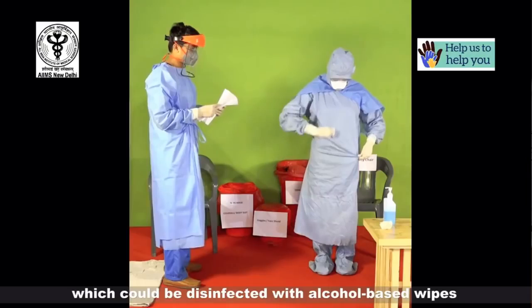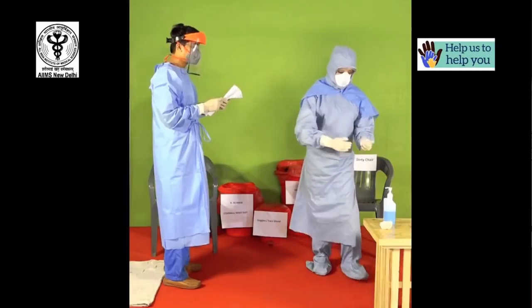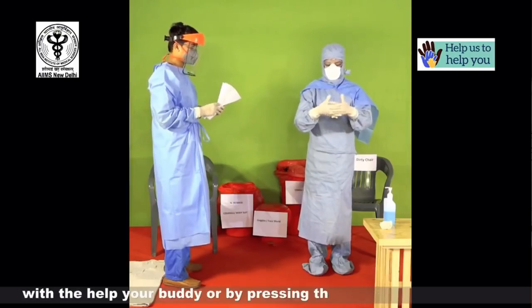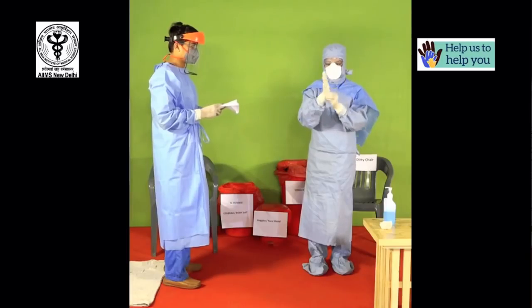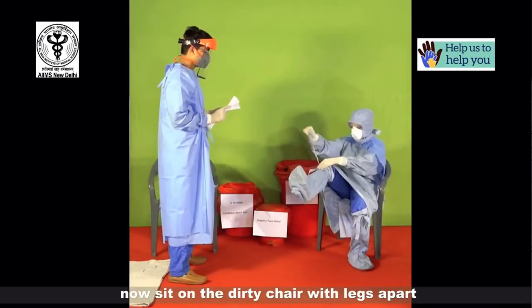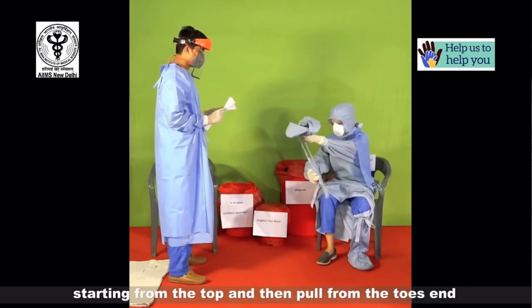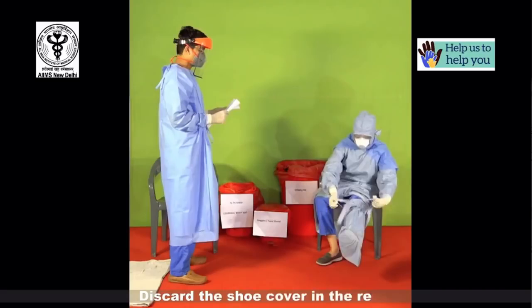Any gross contamination which could be disinfected with alcohol-based wipes. Now first disinfect your gloves with alcohol-based hand rubs; this should ideally be dispensed from an automated system or with the help of your buddy or by pressing the nozzle with your elbow to prevent contamination. Now sit on the dirty chair with legs apart. Remove the shoe covers by opening the straps, slowly pull the shoe cover from the outside surface starting from the top and then pull from the toes end. Try not to cross over your legs while sitting. Discard the shoe covers in the red bin.